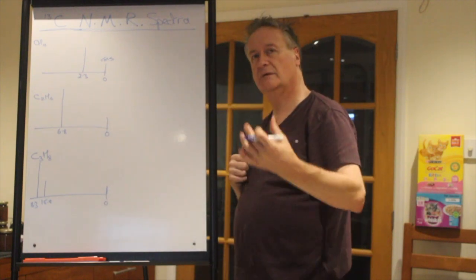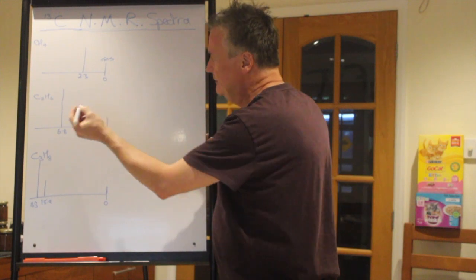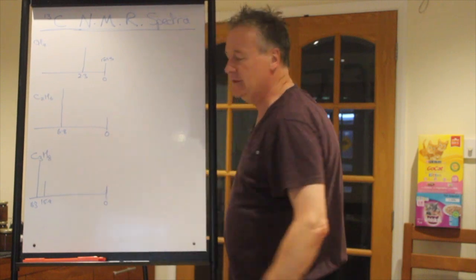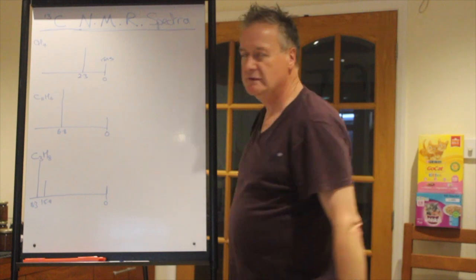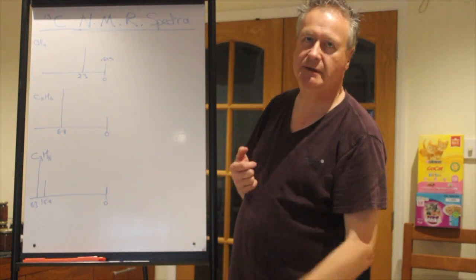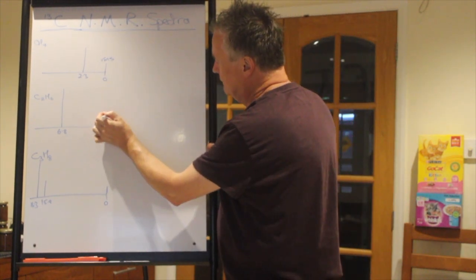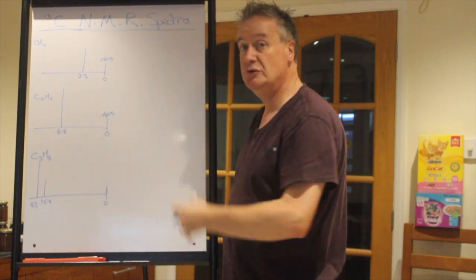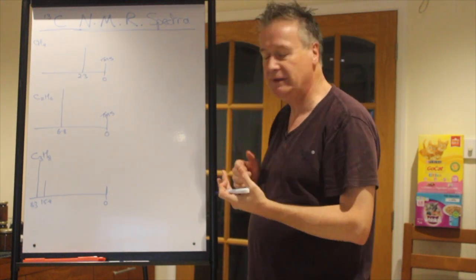I see it in multiple choice questions sometimes, but often it's a single point thing about what is the reference or what's the TMS for, it's a reference. When you look at the next one, ethane, slightly further over, but on a scale it goes up to 240 for carbon-13 NMR. That's not a massive shift that way from 2.3. The scales along the bottom are just not the same. I'm just sketching them out. So TMS again, it's twice the height. Why is it twice the height? Because there's 2 carbons of an identical environment absorbing, so the peak will be twice the size.